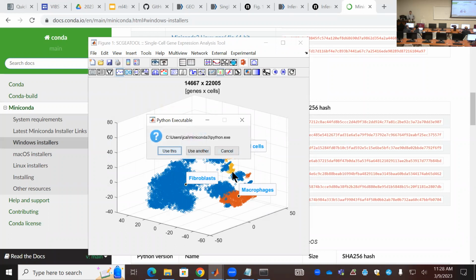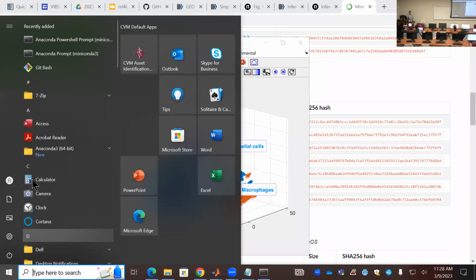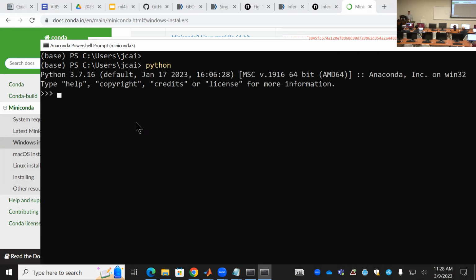Yeah, so now I think I'm ready. But in this package, I haven't installed scTenifoldXct, so I have to redo the scTenifoldXct. Have you gotten to this step here? You reach this step? No, I need to know which version of Python this is. Okay, that's good.